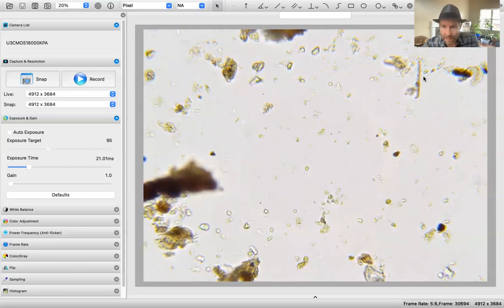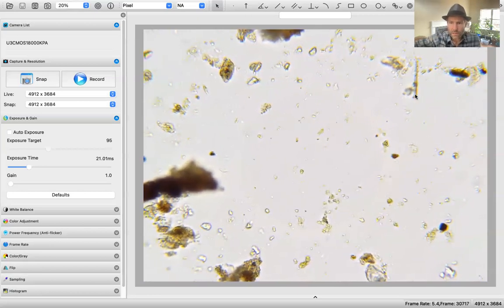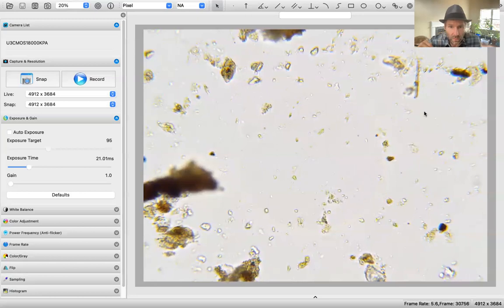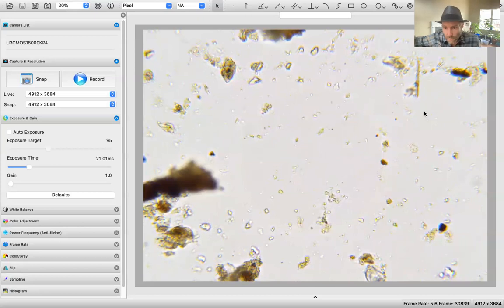Yeah, this looks smaller than this end, so I'm not counting that, and it's just not clear. I don't see any flagellates. I'm looking real hard too, not seeing them. So that concludes our verbal section, I believe.